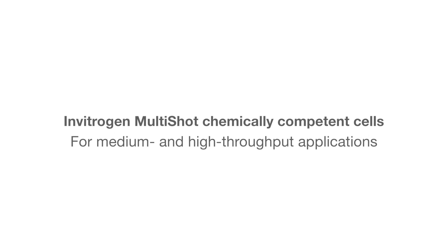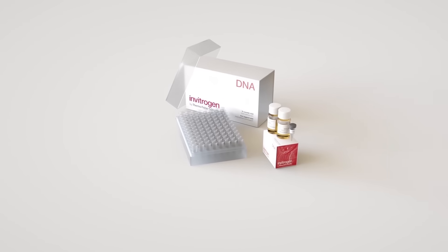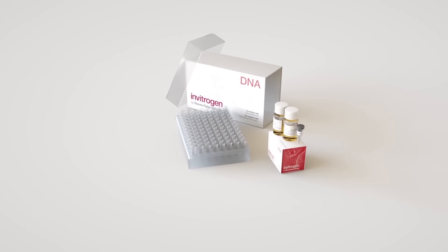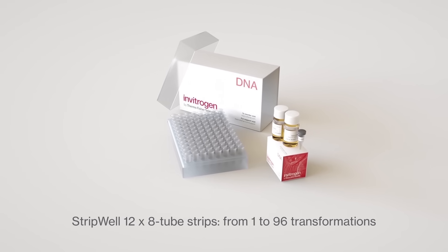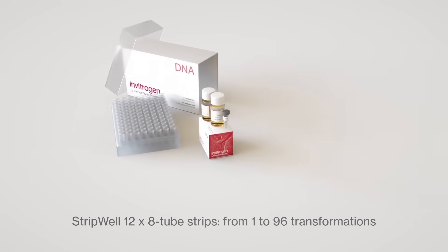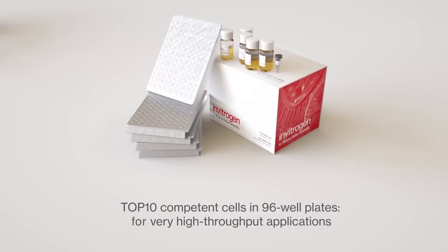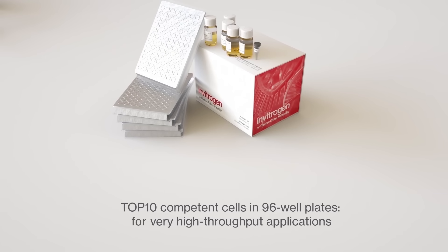Multi-Shot Competence Cells offer flexible transformation throughput and expand your discoveries. Multi-Shot Strip Well 12x8 tube strips allow you to perform 1 to 96 transformations, offering very high throughput applications with Top 10 competent cells in 96-well plates.